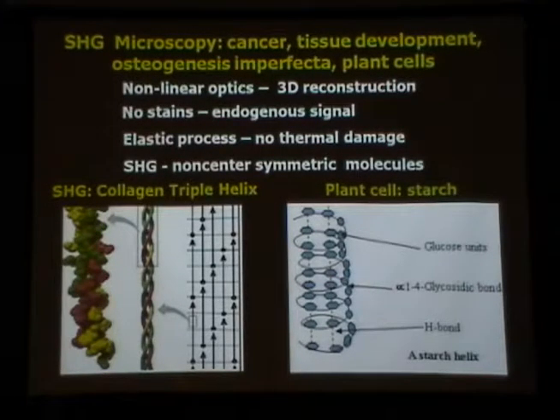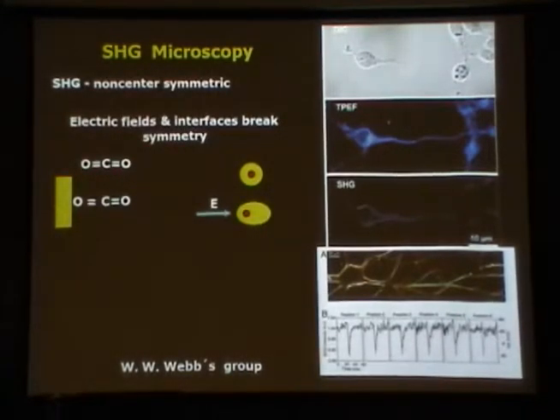Now you can use second harmonic generation. The main generator of second harmonic signal in biological tissue are the collagen fibers. And if you go to plant cells, it's starch here. And for you to have second harmonic generation, you need non-centrosymmetric molecules. But you can use this because, first of all, electric fields can break the symmetry, and interfaces can break the symmetry. For example, this molecule is completely symmetric, but as soon as there are oxygen bonds to the surface, it changes and breaks the symmetry. So the second harmonic generation will show pretty much the interface, while the fluorescence will show everything there. And if you have electric impulses in the nervous system, each time that one impulse comes, you're going to generate second harmonic generation by that time.